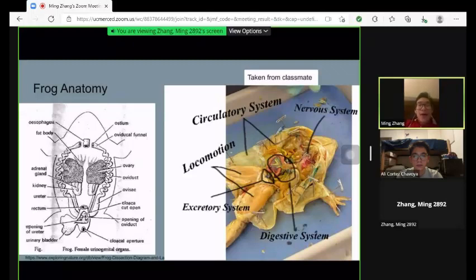Next, the nervous system. While the head of the frog was not dissected, we can still see somewhat what looks to be the spine at the back. This and the brain make up the central nervous system. The nerves around it that control muscle movements and the like make up the peripheral nervous system.